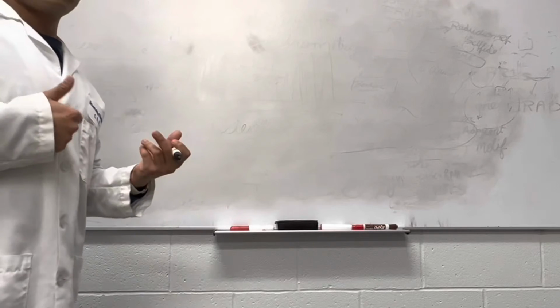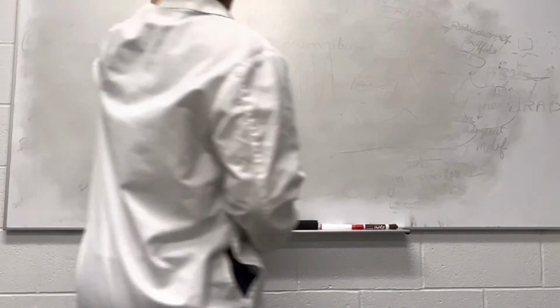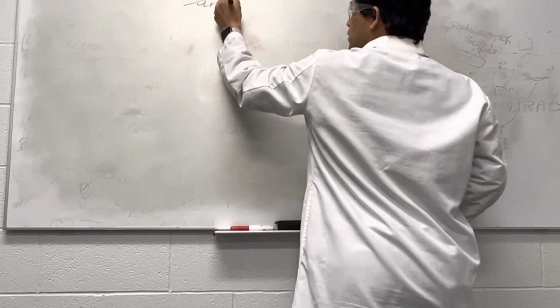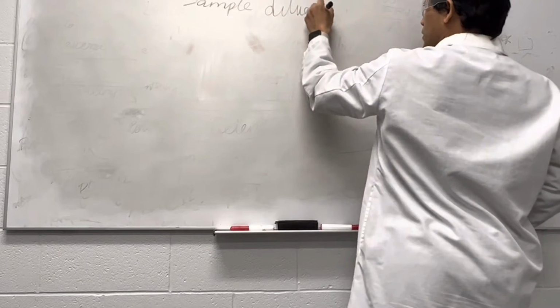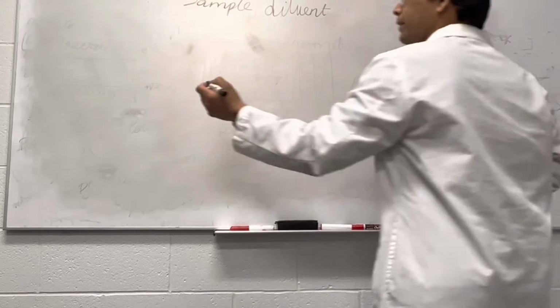In this video, we will discuss LCMS sample diluent. First of all, we will understand what an ideal chromatogram looks like.